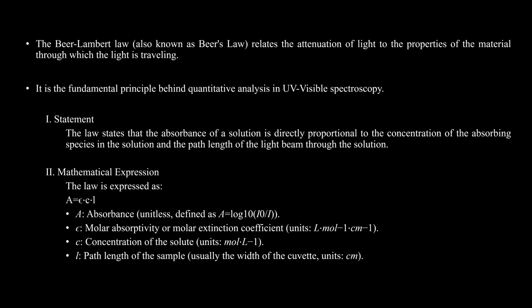In quantitative analysis with ultraviolet spectroscopy, absorbance is directly proportional to the concentration of the solution and the path length of light through the solution. Mathematically, A equals log10 of I0 over I, equals epsilon times c times l, where epsilon is the molar absorptivity, c is the concentration of the solute, and l is the path length of the sample.